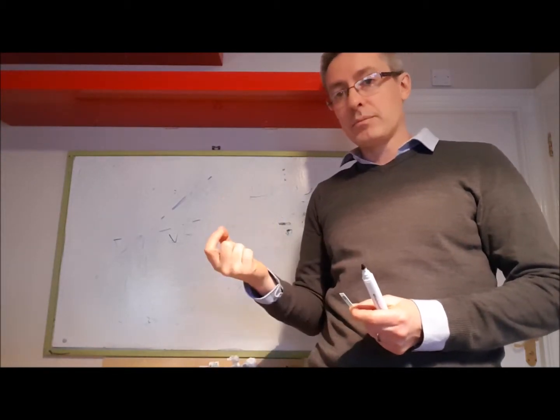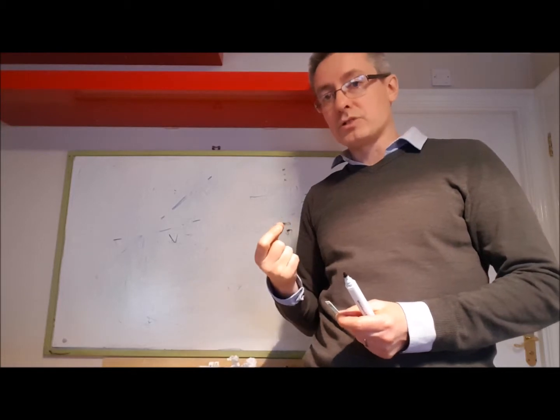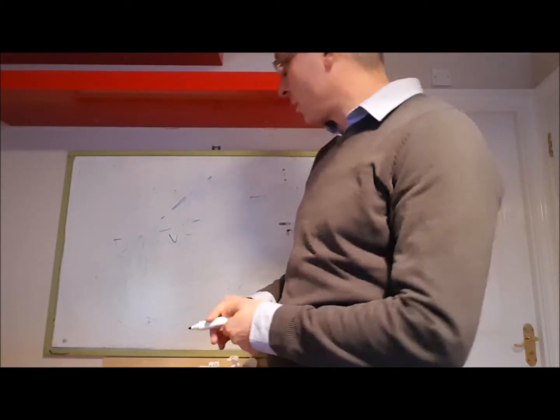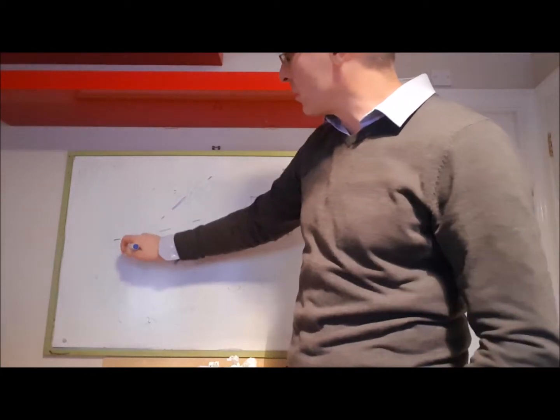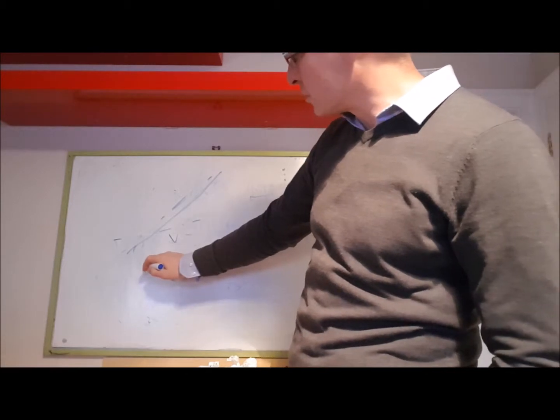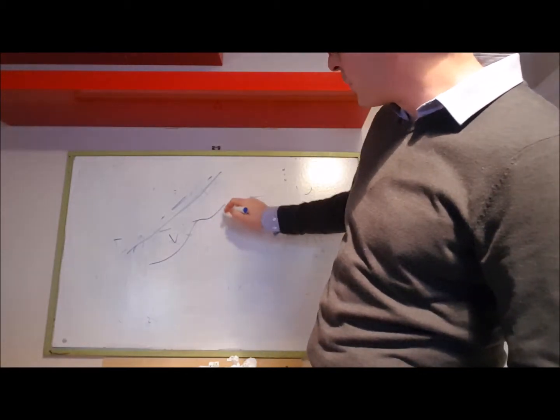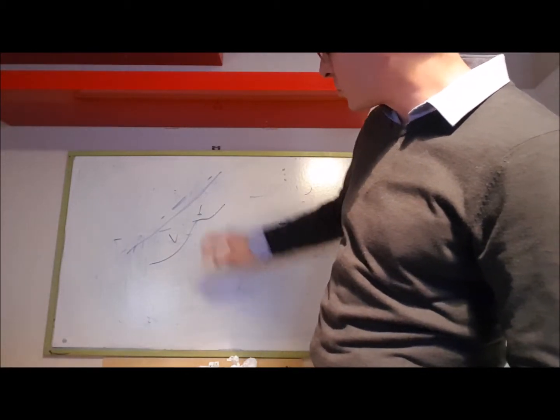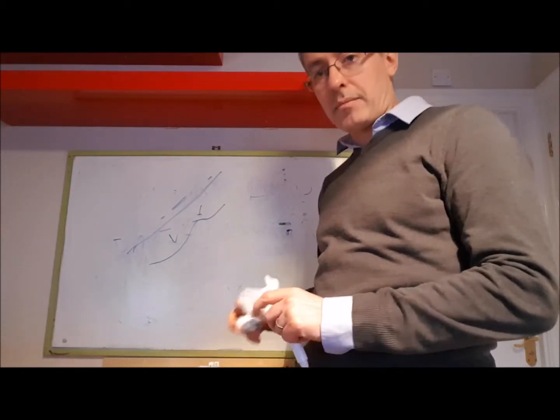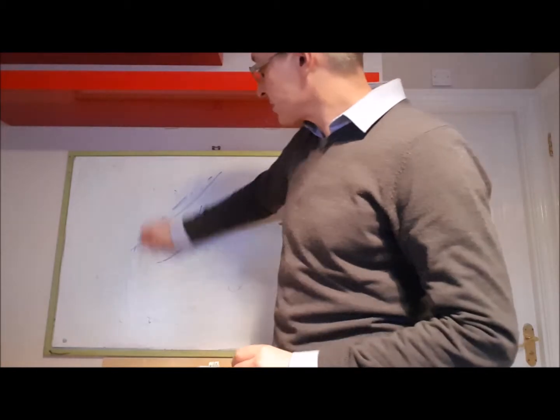So sometimes I'll mention the micro and mini electrodes that we have, which might give you more features, whereas a macro electrode would give you lots of big signal that looked like a straight line. If you do a CV in a micro electrode, you might end up with a bit more of a feature, which would have got lost on the macro electrode. So trying these mini and micro electrodes might be an idea.